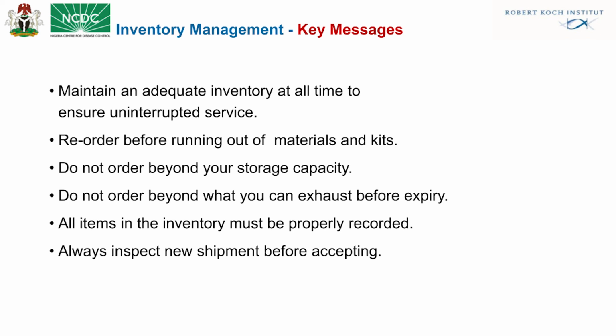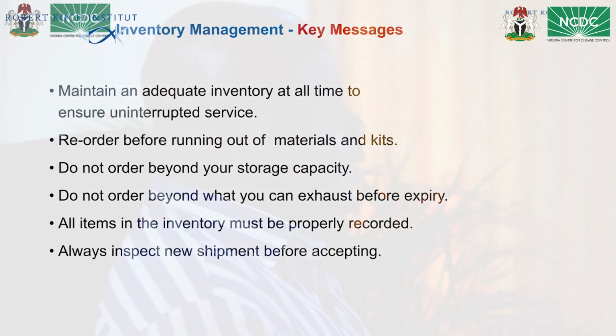Do not order beyond your storage capacity. Do not order beyond what you can exhaust before expiry. All items in the inventory must be properly recorded. Always inspect new shipments before accepting. This is very important in order for us not to receive an expired product, and at the end of the day we will not be able to use the materials or the kit.